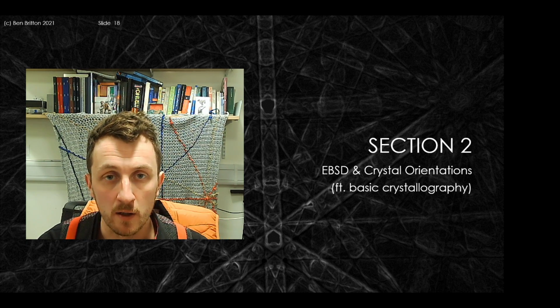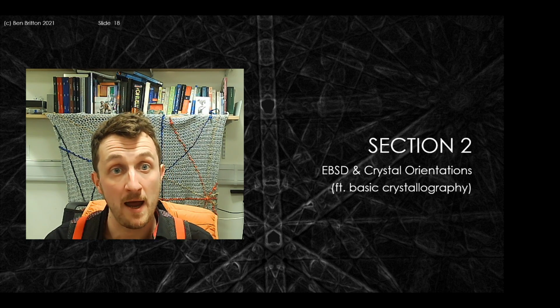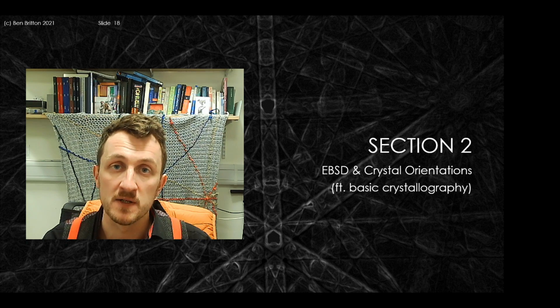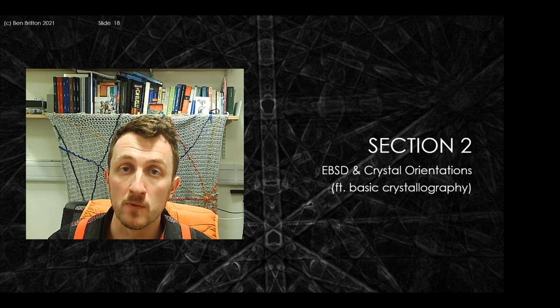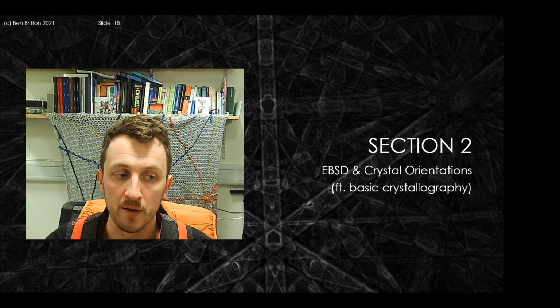In this section, we're going to look at EBSD and the measurement, or the understanding of how this relates to crystallographic orientations. This is going to have some basic crystallography to enable people to recap and ensure that pertinent features of the diffraction pattern are understood.